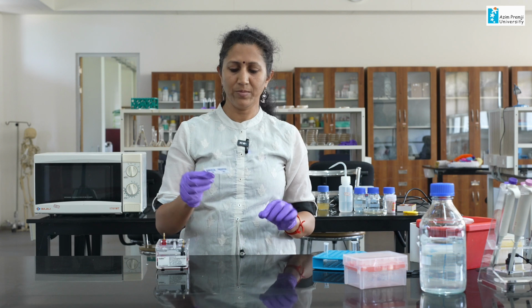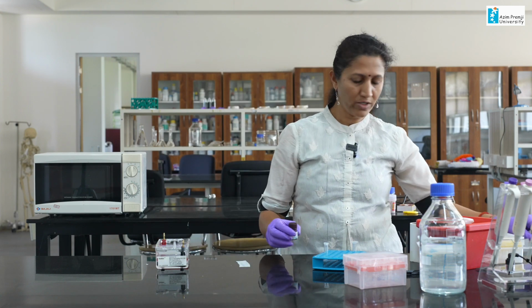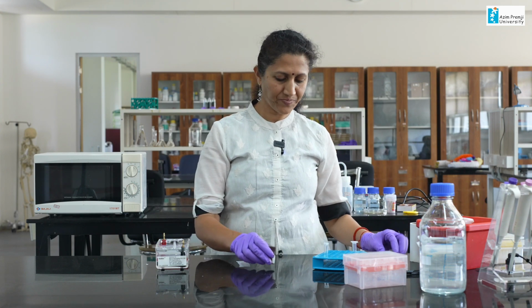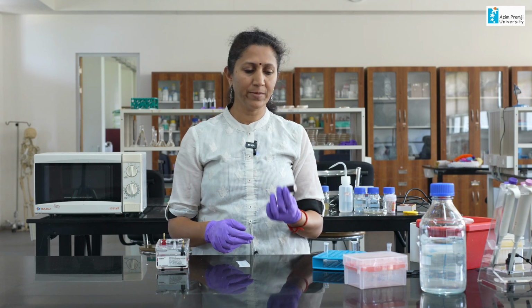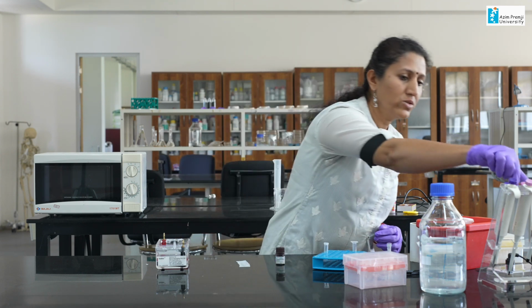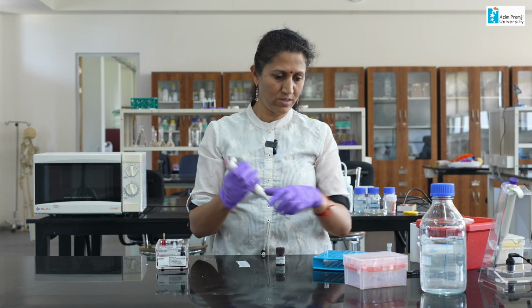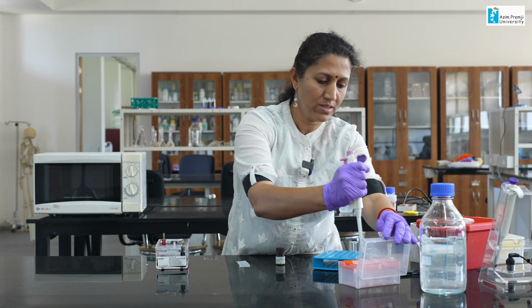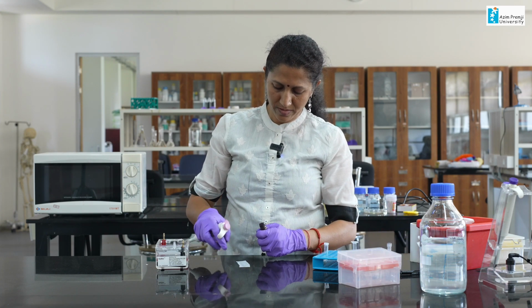To load the DNA sample, I am going to take cellophane paper, and then I am going to use gel loading dye. This is 5x sucrose gel loading dye. You can get the ready-made ones. So, I am going to take 2 microliters of the gel loading dye on the cellophane paper.